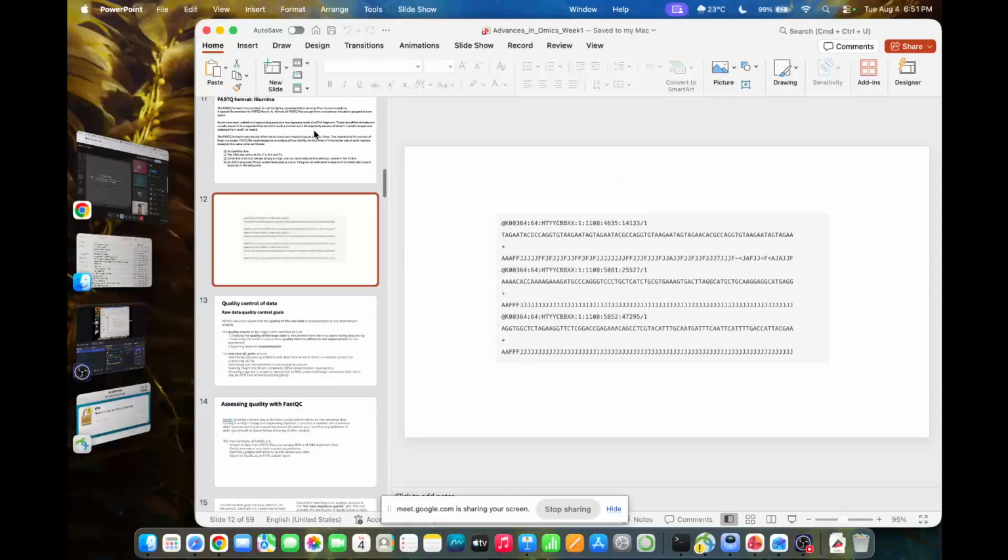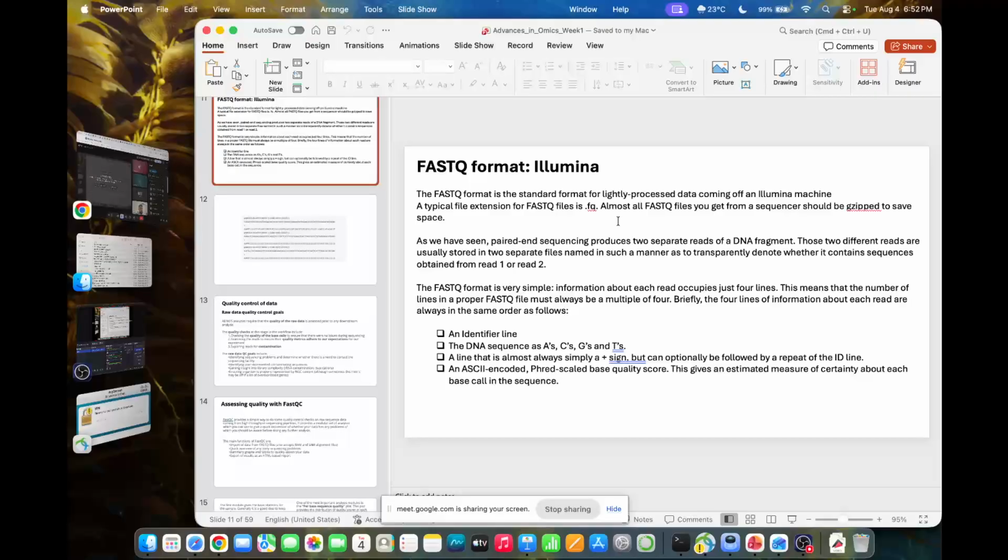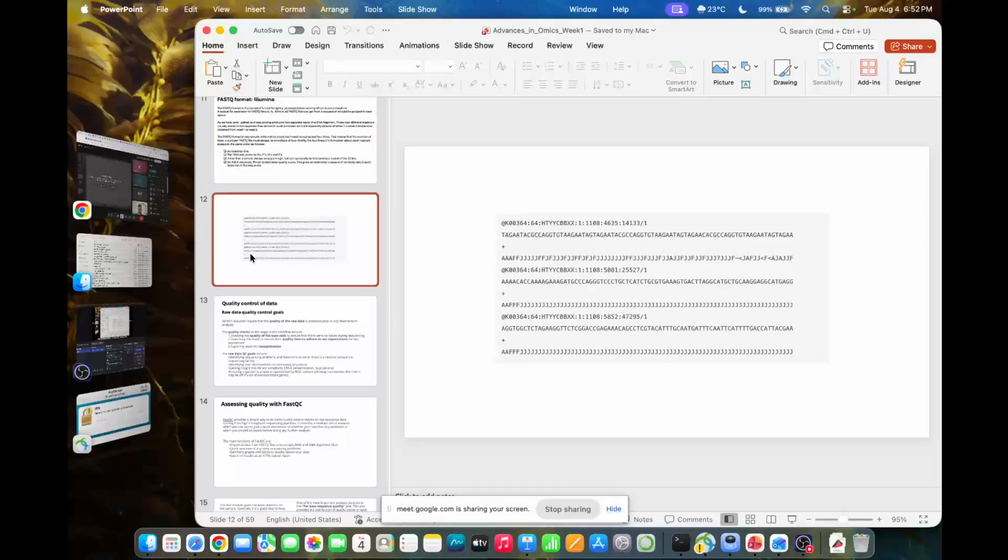Yeah, you get a file something like this. Let us assume you have done Illumina, which is the most used technique currently. You get a FASTQ file out of it, which is not very complicated. It's a stretch of these reads, right? These are the quality parameters below. This is the ID of the read, and this is what the read has in terms of the sequence.